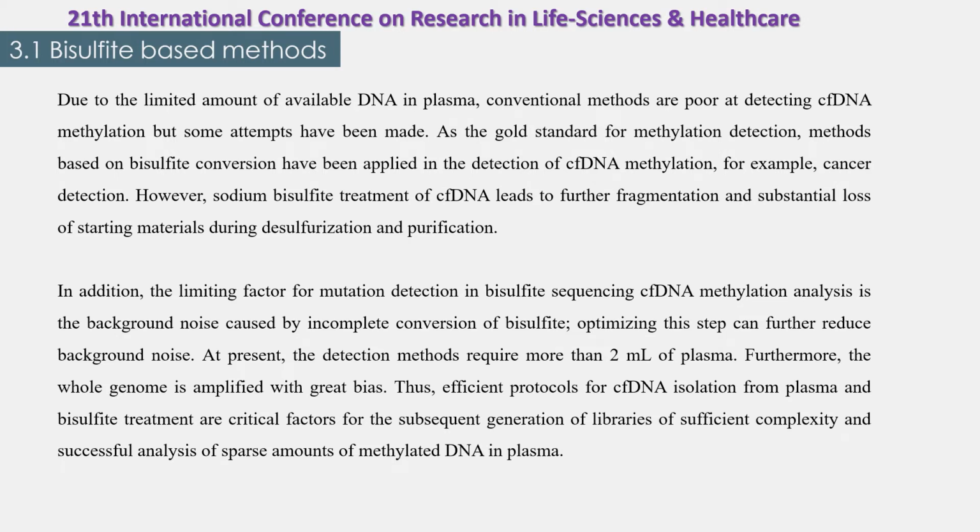However, studies show that bisulfite treatment of cell-free DNA leads to further fragmentation and substantial loss of starting material during desulfonation and purification.